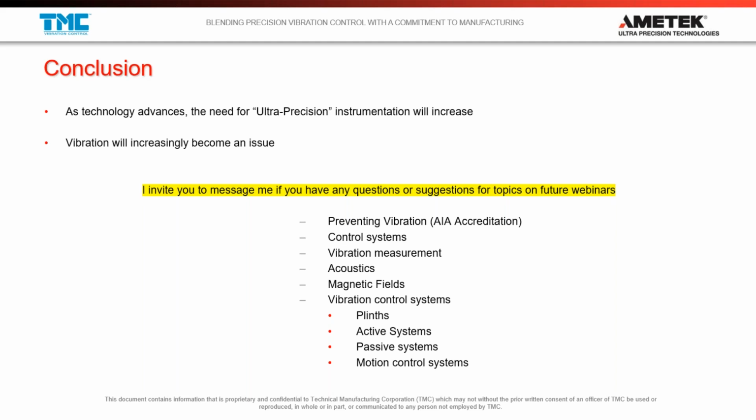So an inner mass only needs to be a few kilograms, and then on top of the system you could put several thousand pounds, because really the key to the inner mass is just a surface to provide a high frequency separation and rest your sensor on. It's really not something that needs to be there. Its mass is really not critical to provide a decoupling from anything that's above it. Okay, thanks. I should say decoupling, I'm sorry, decoupling from anything that's above it.